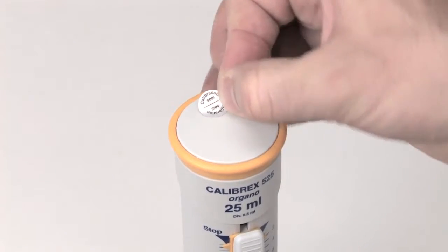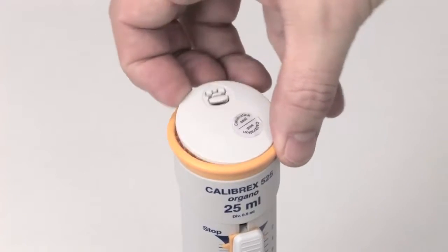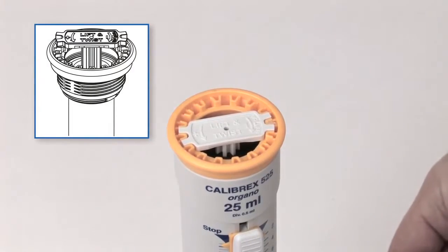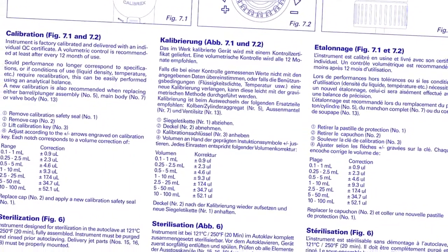The access to the calibration mechanism is protected by a sticker. The calibration key is located under the plunger cap. The calibration key shows the setting indication to simplify the adjustment procedure. Each notch corresponds to a specific volume change. The details and corresponding chart are given in the operating instructions.